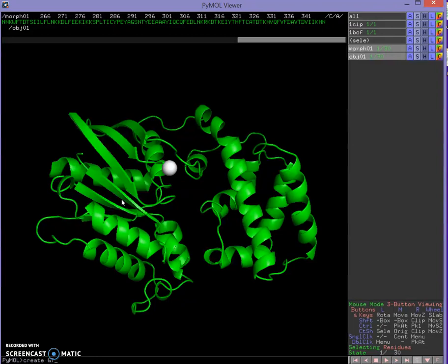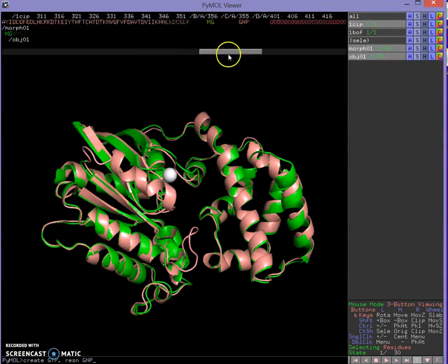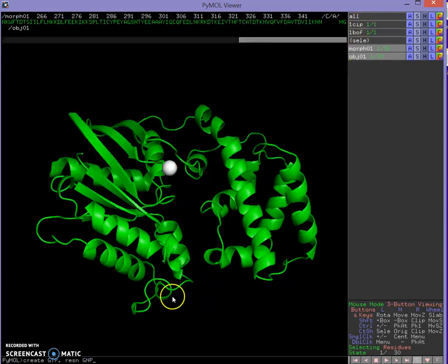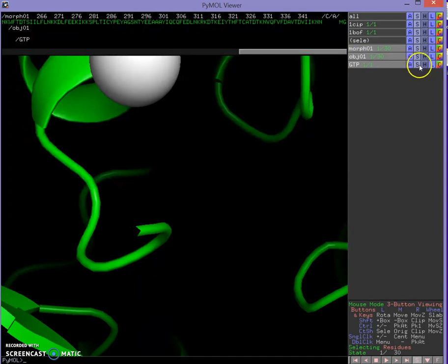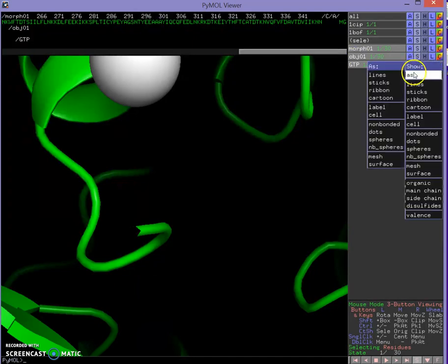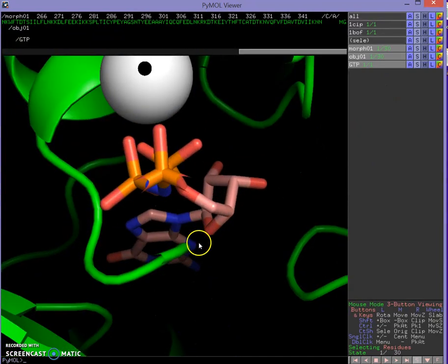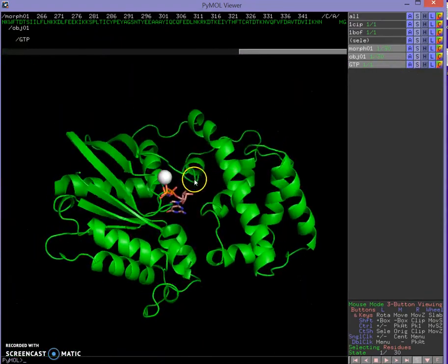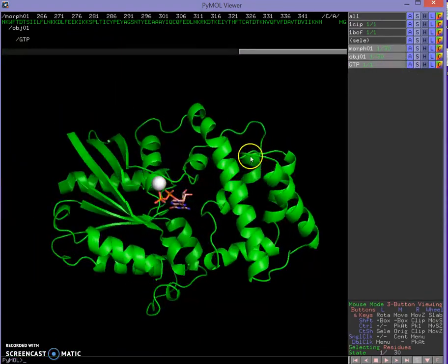I'll type 'create GTP, resname GNP'. The reason I'm doing that is if you look at the GTP-bound form 1CIP, GNP is what they use for GTP mimics. So we create that, turn that off, and now GTP is an organic molecule — I'll show that as sticks. There's our nice GTP in the active site. Then I'll orient back out on the morph.